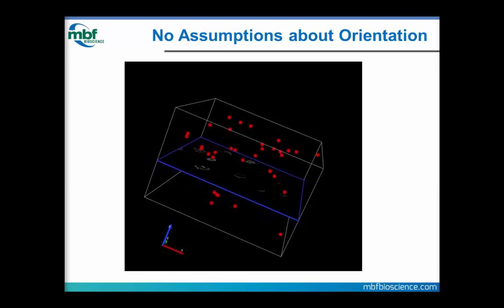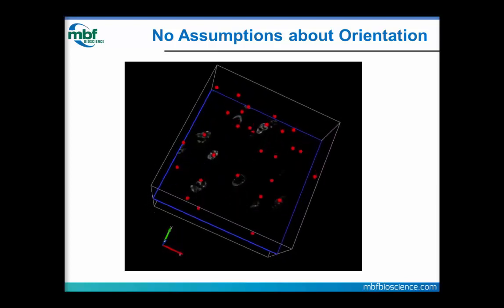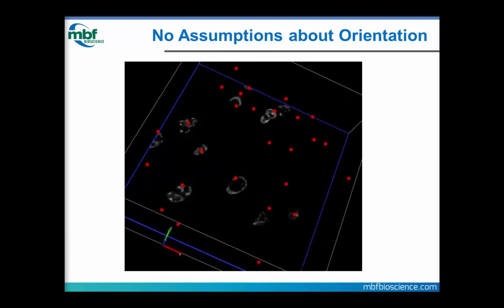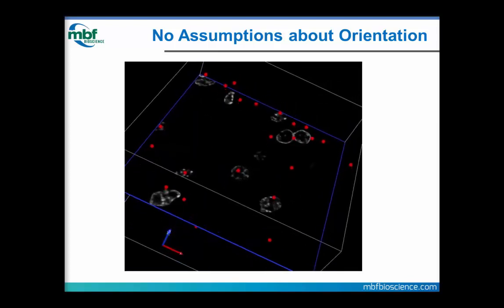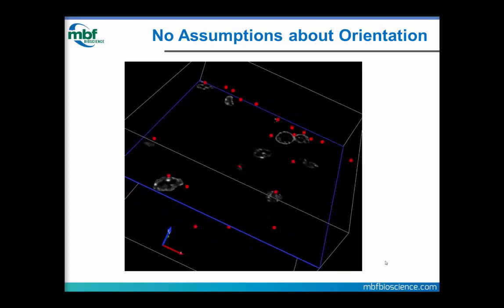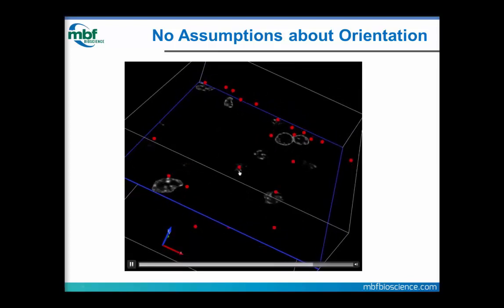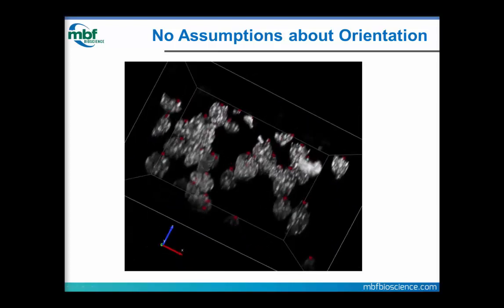We're going to be focusing up and down through thick tissue sections, 20 or 25 or 30 microns thick, using thin Z-planes. So in the case of these cells, we're going to have to use oil lenses, and that's so that we can find the tops of the cells. So for instance, right here, here's the cell top. It gets a red circle. Every cell has one and only one leading edge. Every cell has only one top. So if we count the cells this way, we won't overcount the cells.